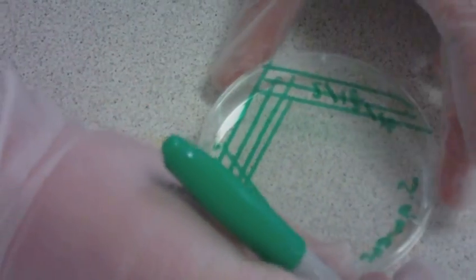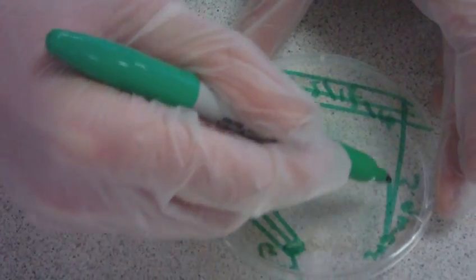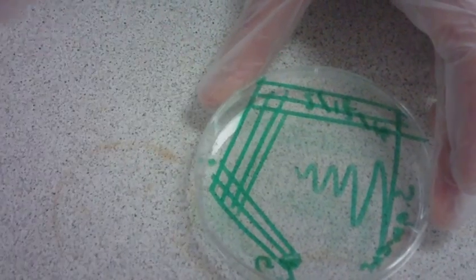After this streaking, you want to do a zigzag streak into the middle of the plate without touching any of the previous lines.